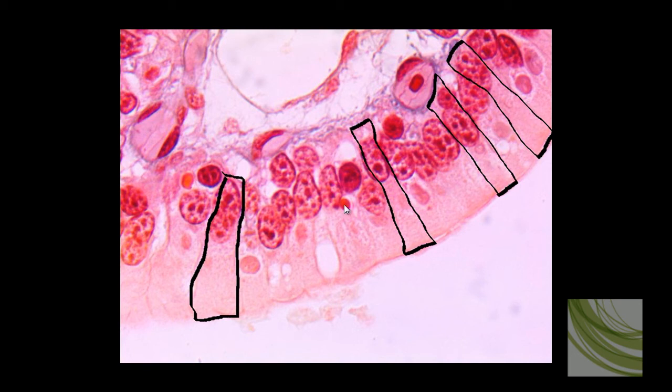You can see these are kind of, and here's another one, these are very irregularly shaped, but generally they're very long in one direction and very short in another.